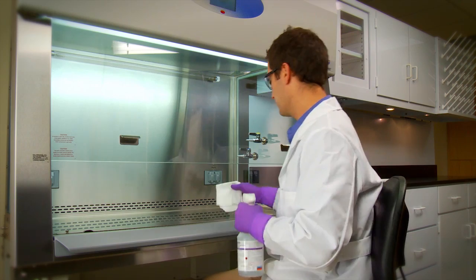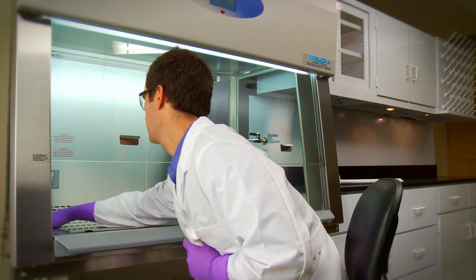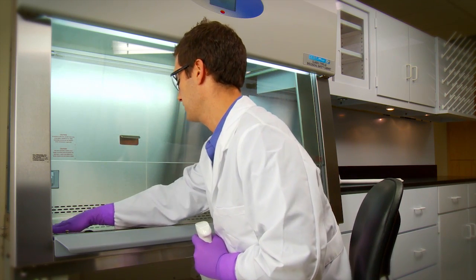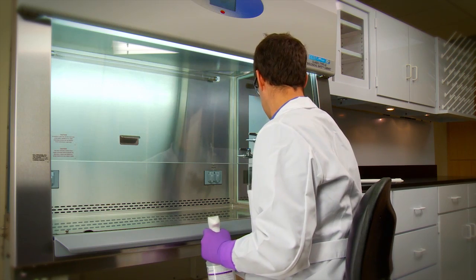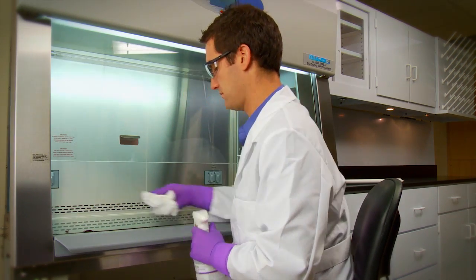Finally, laboratory equipment and work surfaces should be decontaminated with an appropriate disinfectant on a routine basis. This is important after work with infectious materials, and especially after overt spills, splashes, or contamination by infectious materials.